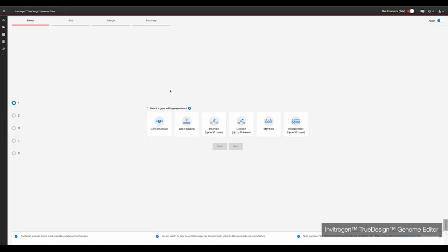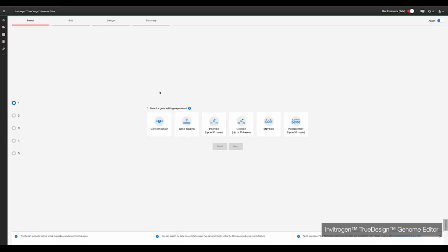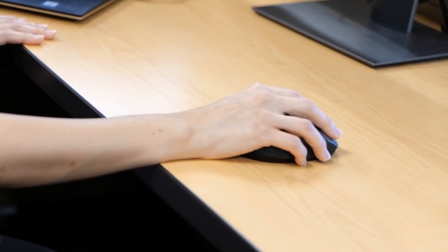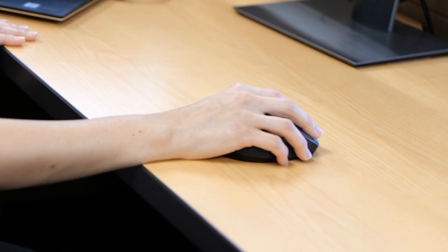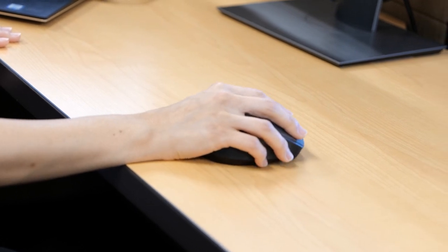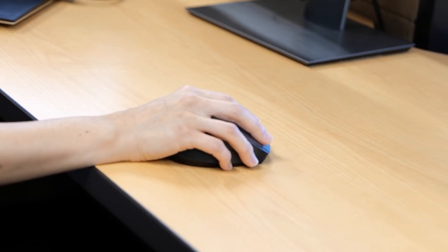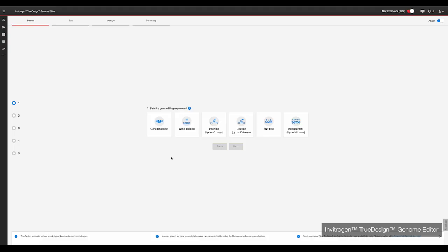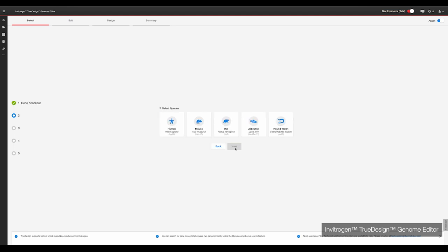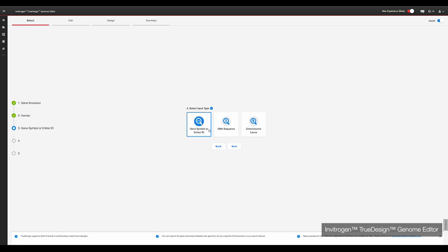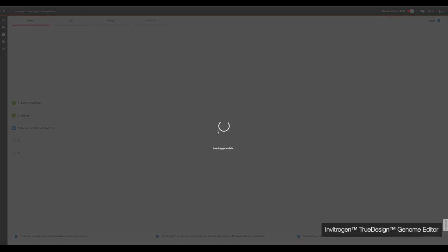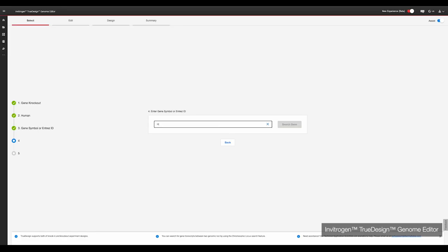The first step is to design the experiment and order the required reagents via the free Invitrogen True Design Genome Editor software. For today's experiment, we're selecting gene knockout, selecting the species of cells — in this case human — and then searching for our gene of interest, in this case HPRT.